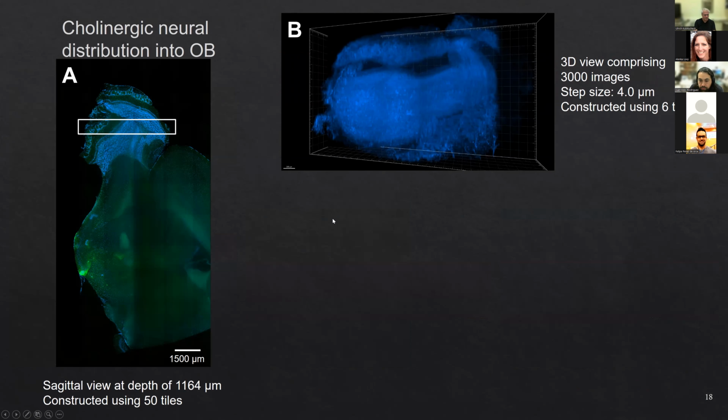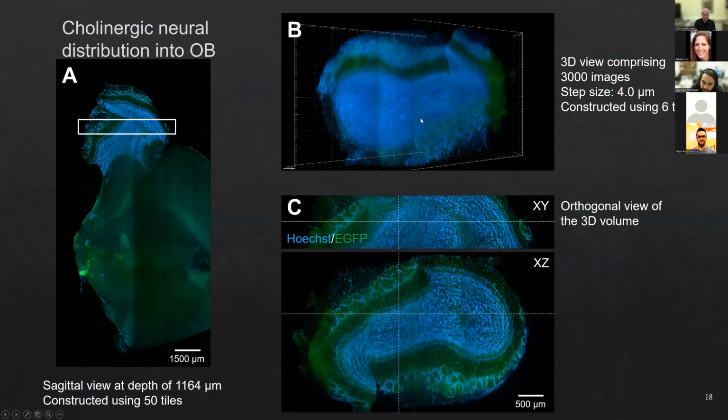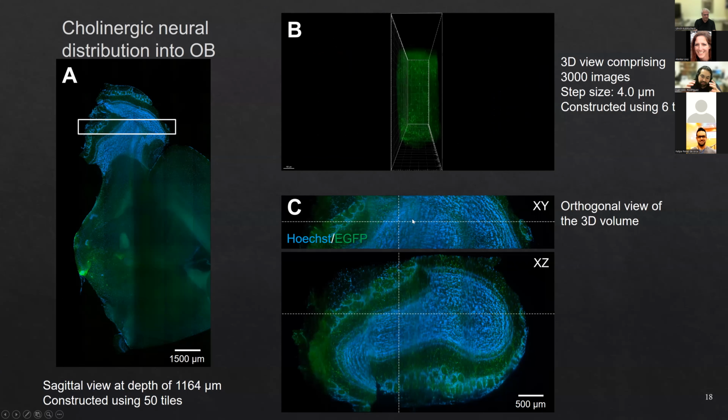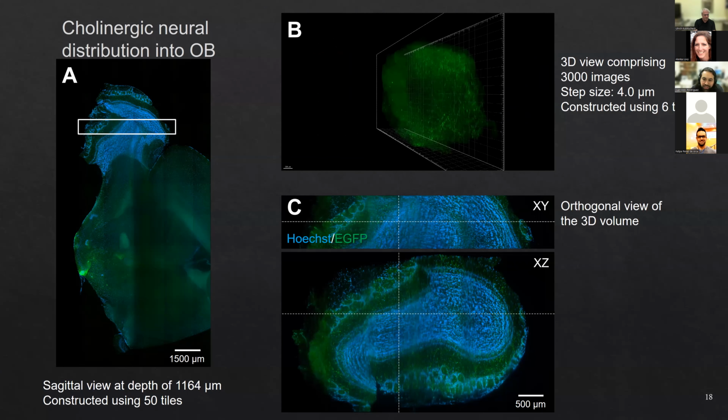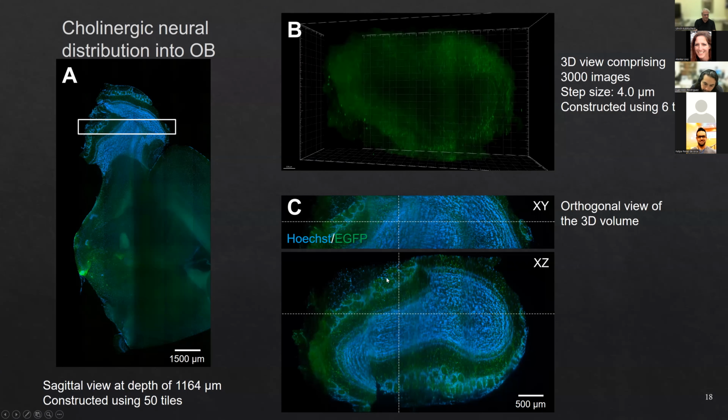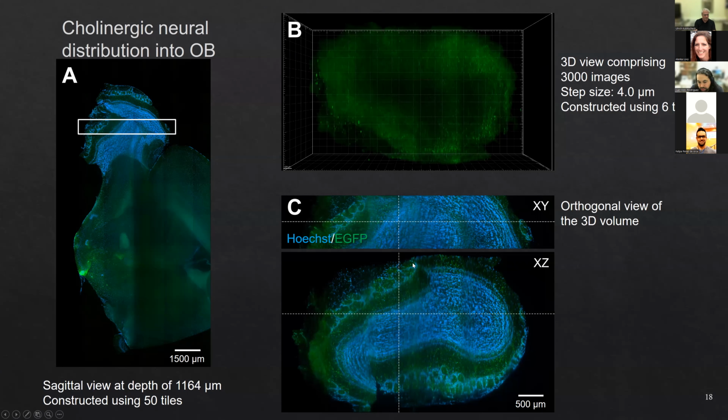So here, what we have finally is all the information in a thick section or in a block of the olfactory bulb. And the idea is to see how the neuronal projections are distributed in mainly these 2 parts, like the glomerular layer that is outside or around the olfactory bulb, and the granular cell layer in the middle.